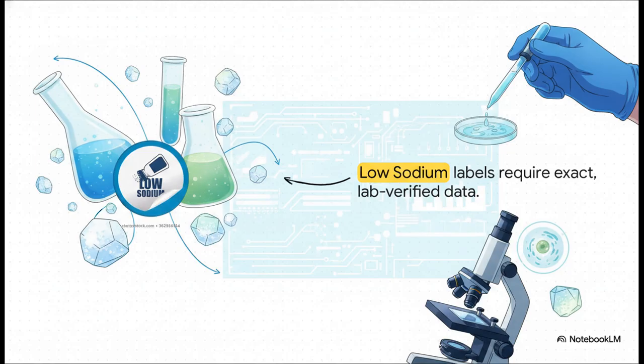You know those low sodium or reduced salt labels you see while walking down the grocery aisle? Well, they aren't just some clever marketing spin. No way. They are legally binding claims, and they are the direct result of rigorous, verified chemical analysis done in registered labs. Basically, we have to prove the math.